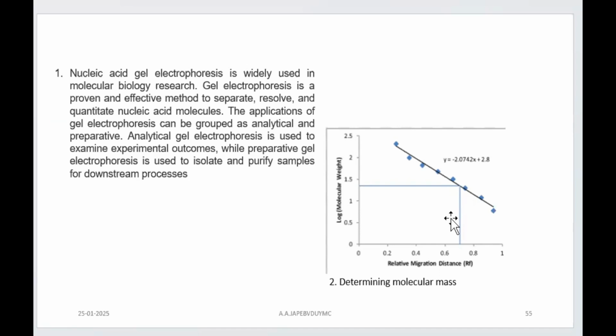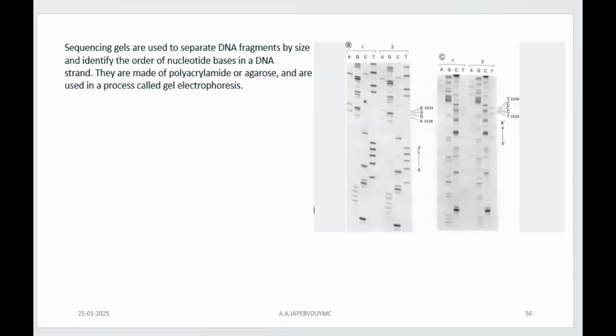Alright, you agree with this? Alright, now let's go to another application. Now here I'm talking about sequencing gels. What are sequencing gels? We have talked about restriction digestion, we have talked about SDS-PAGE, we have talked about special gels which are used for sequencing. We have learned in previous years, that is NGS technology, right? Or Maxam-Gilbert method or Sanger's method, right? So at the end of that, what do you find out? The sequence, right?